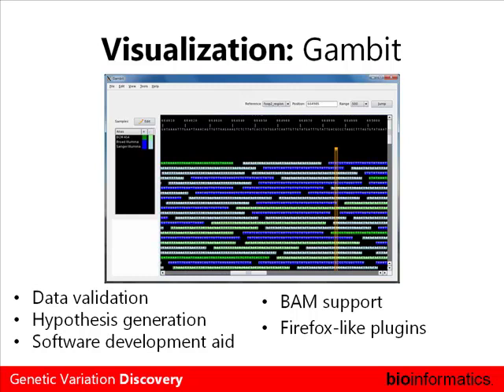So what on earth do I mean by that? One of the things we've noticed when we work with other labs, even in our department, is that next-gen sequencing is still far removed from what the normal molecular biology lab can cope with. So if you do some mutational profiling, can you expect a normal molecular biology lab to actually analyze that? And the answer is increasingly no. So we're trying to make applications that will sort that out.